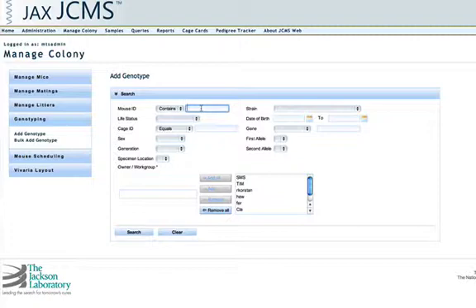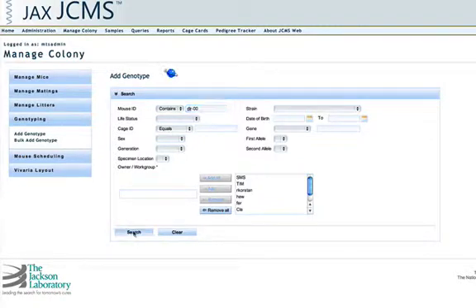I'll go ahead and enter a mouse ID and click search, and this will pull up all the mice that meet that search criteria.